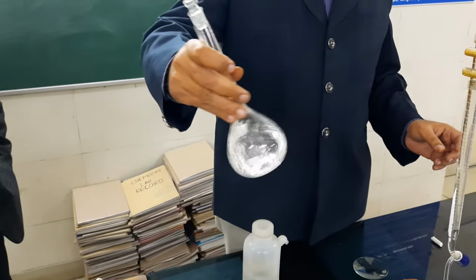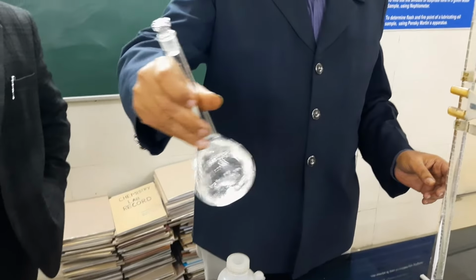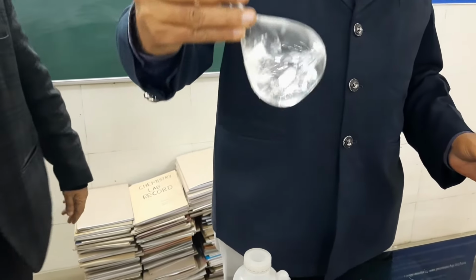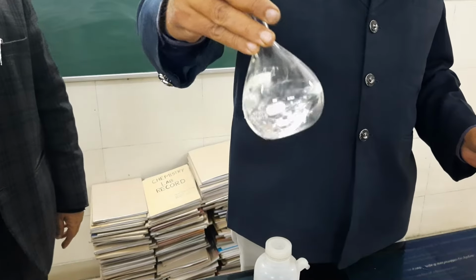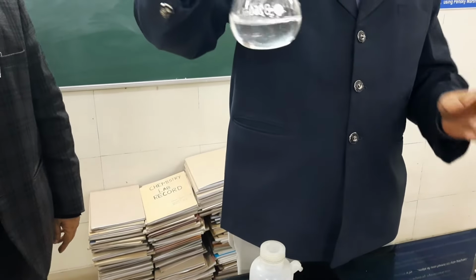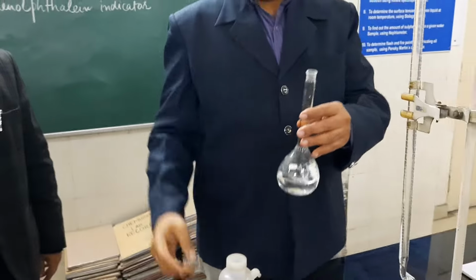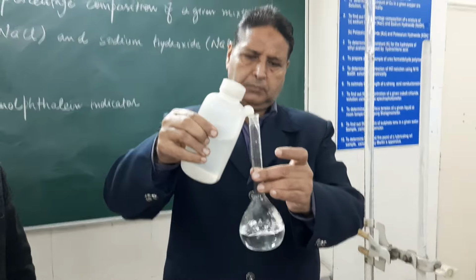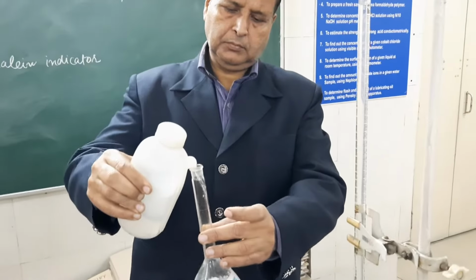Dissolve the mixture and make it up to 250 ml with deionized water or distilled water.